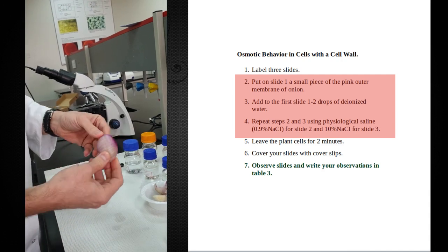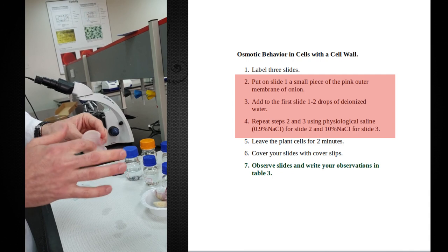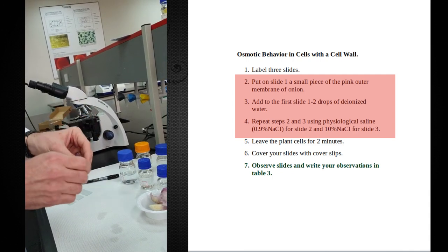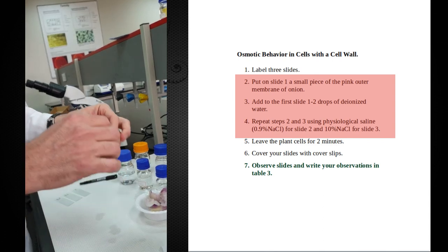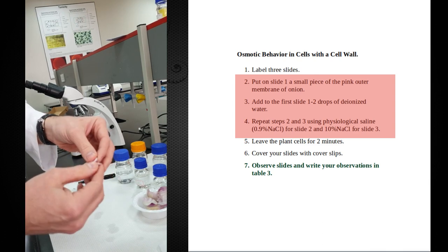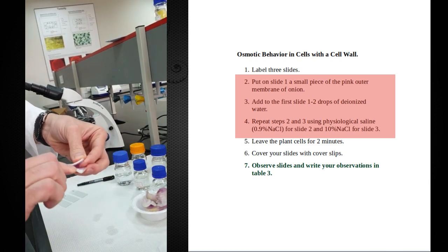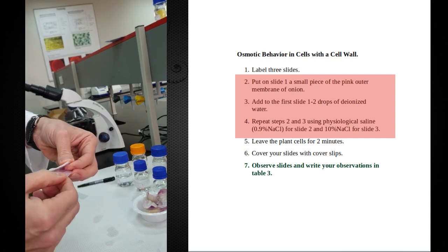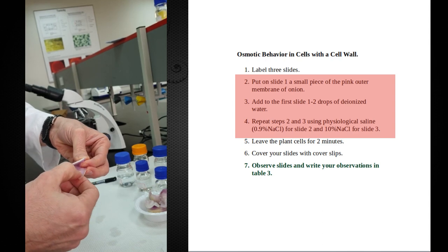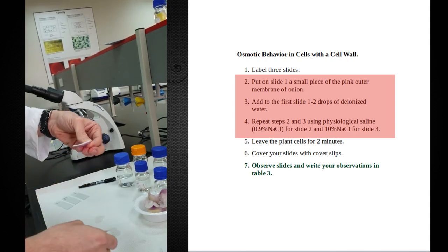Okay, so the way we do this is we break the skin and then we pull. So I'm not interested in this part, and we're not going to be sectioning or cutting anything. We're simply going to break, and now I'm going to start separating that outer skin. This red part right here is what I'm actually interested in, and so I'm going to pull until I have a decent sized piece. This is more than enough.